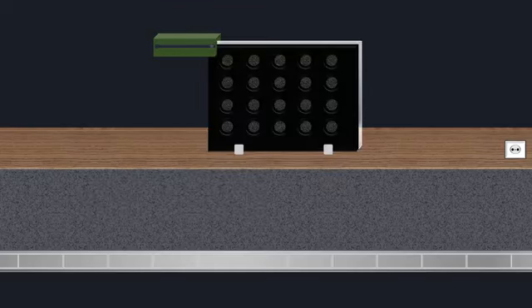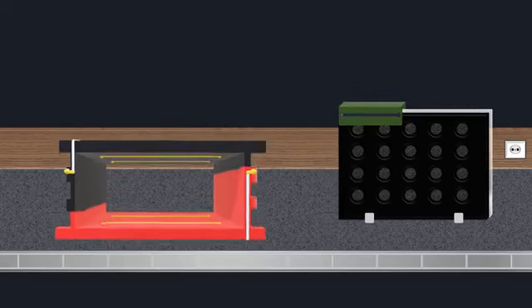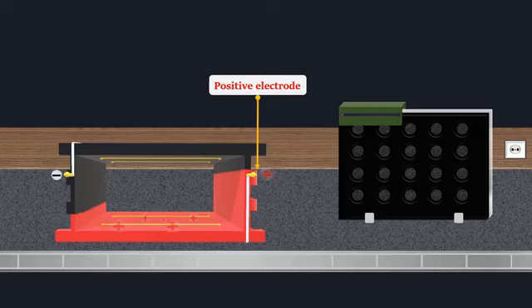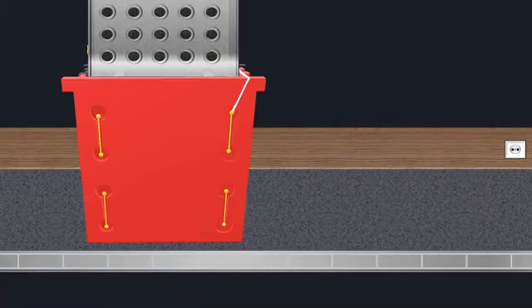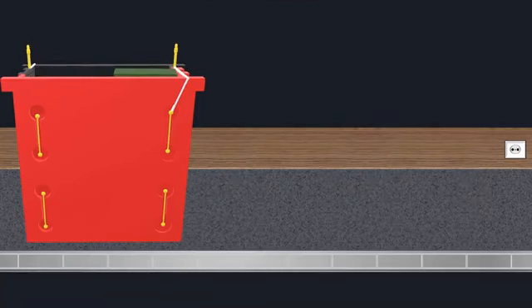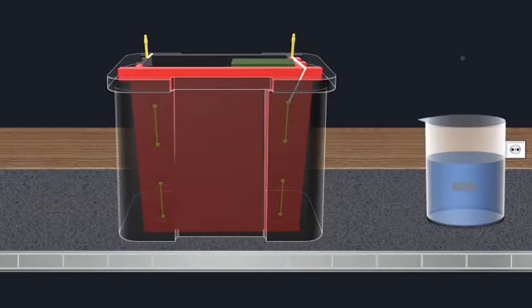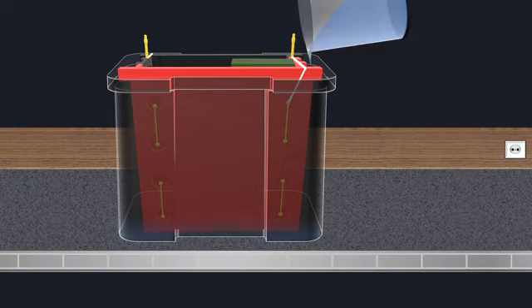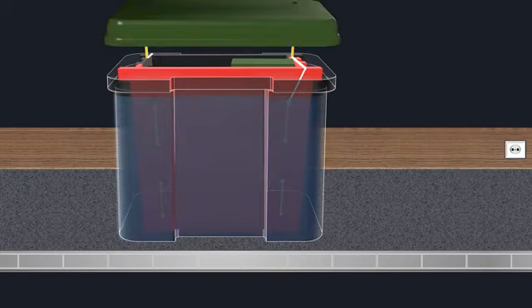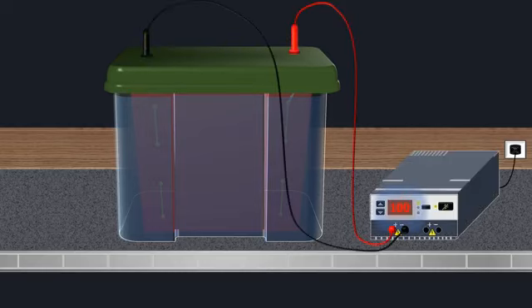The most commonly used method for transferring the proteins is called electroblotting. During this transfer, an electrode assembly with a positive electrode and a negative electrode is used. The gel holder cassette is inserted into the module, ensuring that the cassette is properly positioned from negative to positive. The inner module is placed into the electrophoresis chamber. Then, the chamber is filled with the blotting buffer. Next, a lid is placed on the electrophoresis tank, and electrical leads are connected to the power supply to run the blot.